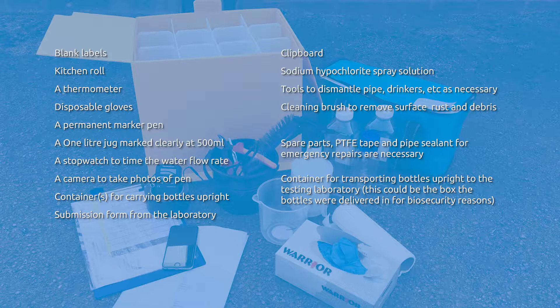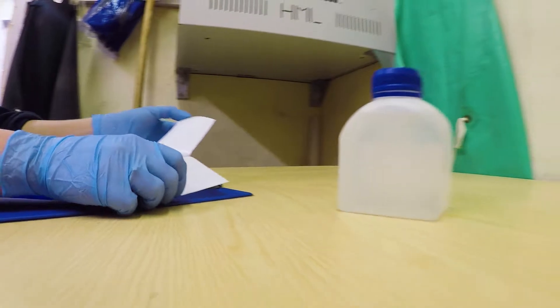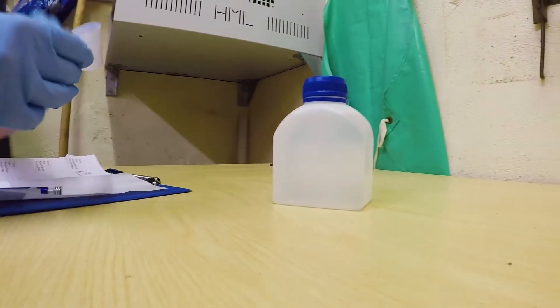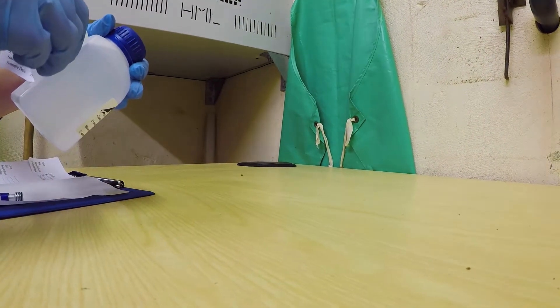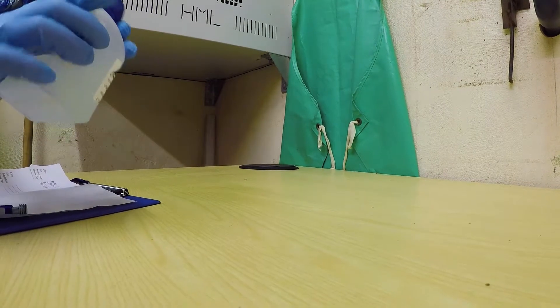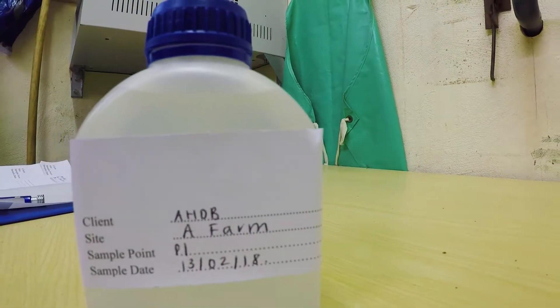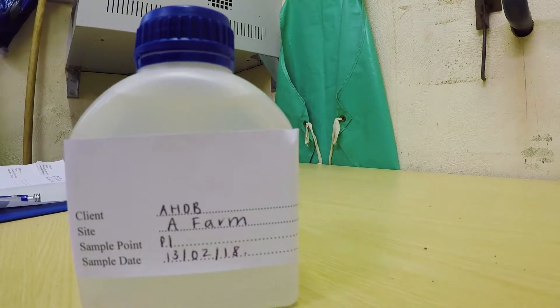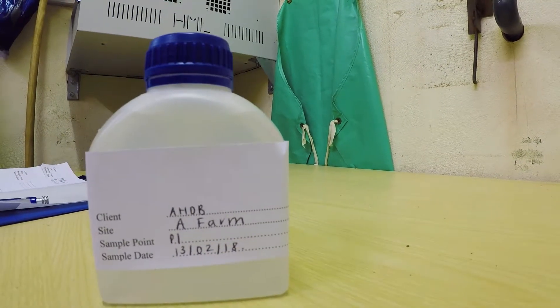Once your bottles have arrived, start by completing a label for each one. It is advised that you don't affix these until after the sample has been taken. However, in order to prevent bottles being mixed up, you can always mark the lids using a permanent marker.